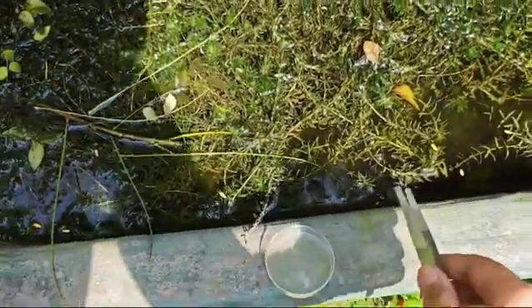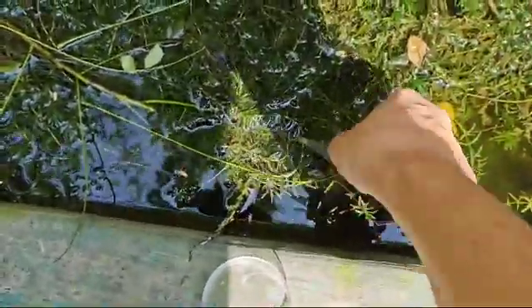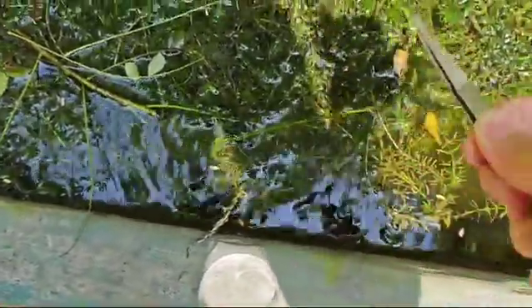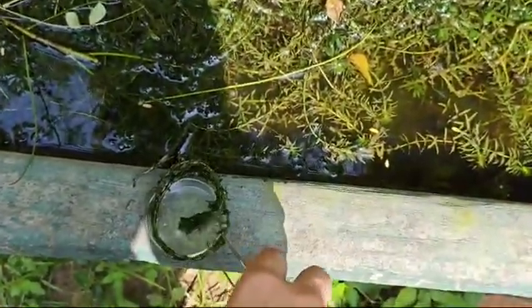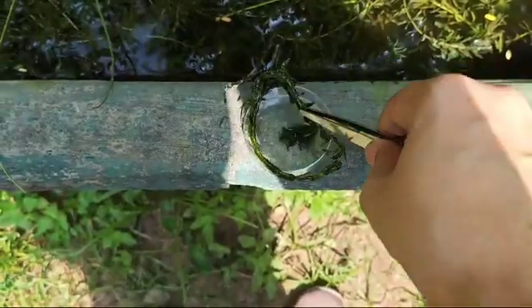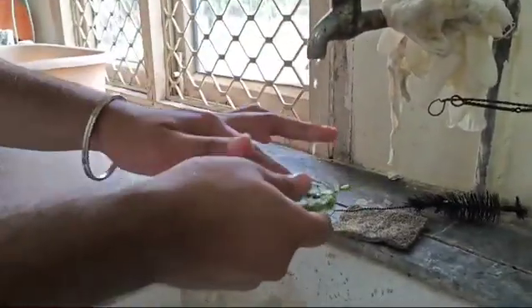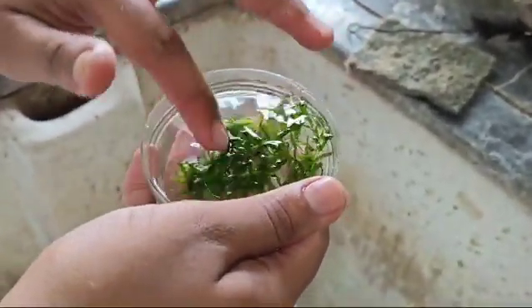To observe cytoplasmic streaming in hydrilla leaf, first we will collect some hydrilla from a pond or anywhere you can find it. Wash it thoroughly to remove the excess matter which might be present in the water with the hydrilla leaves.